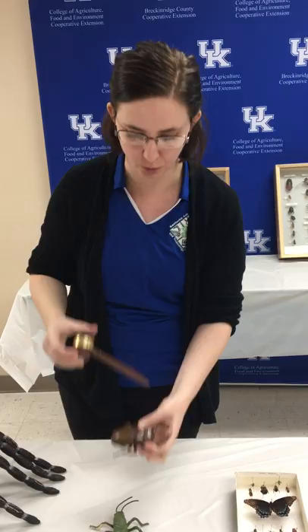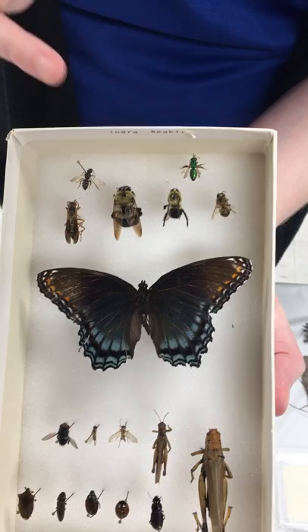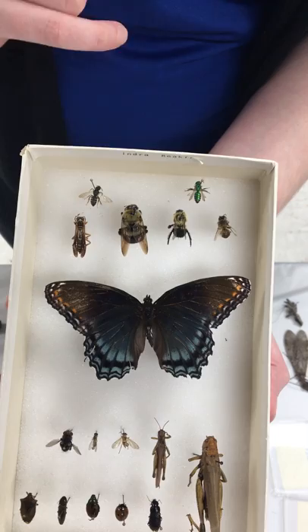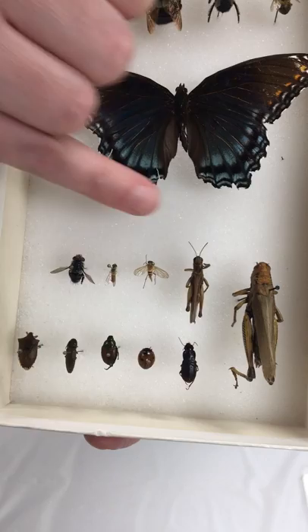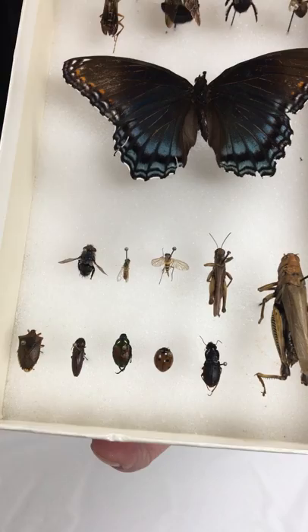Looking at some specimens I've already pinned: insects in the top half of the box are pinned through the middle of the thorax — including bees, ants, wasps, and even butterflies and moths. Insects pinned a little off to the right include flies, grasshoppers and crickets, any true bugs with that characteristic little triangle shape, and beetles — whether ladybugs, June beetles, click beetles, ground beetles, or anything like that.